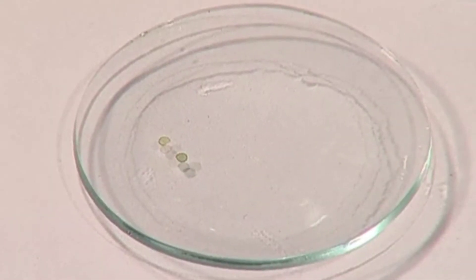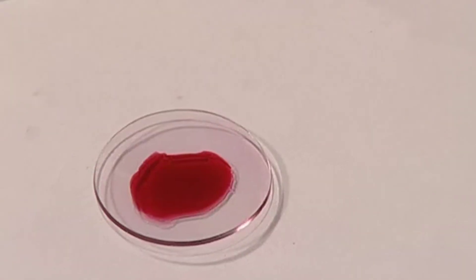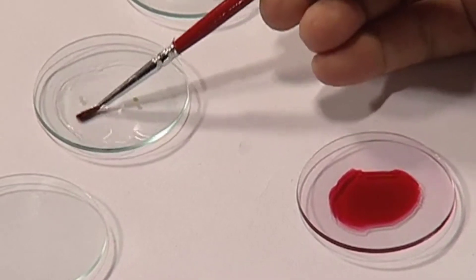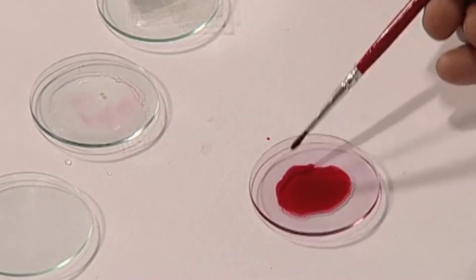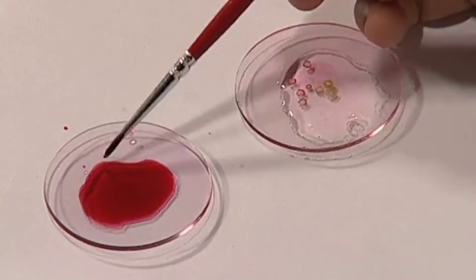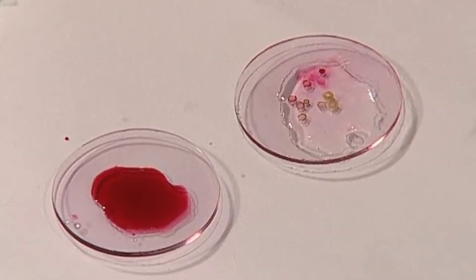Now we want to stain these sections. For this, we will take safranine stain, dilute it with some water, and put these sections in safranine stain. Keep it for one or two minutes and then take it out into a watch glass having water. These sections are then transferred to a watch glass containing water.